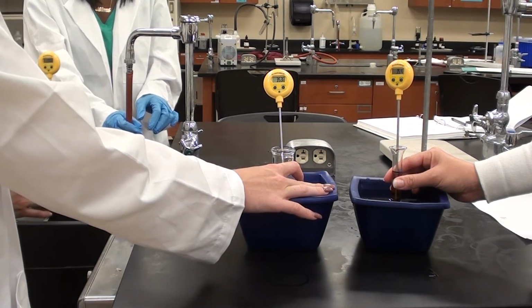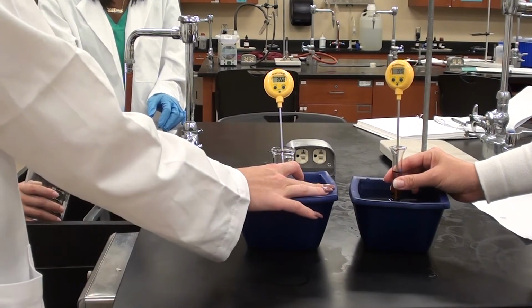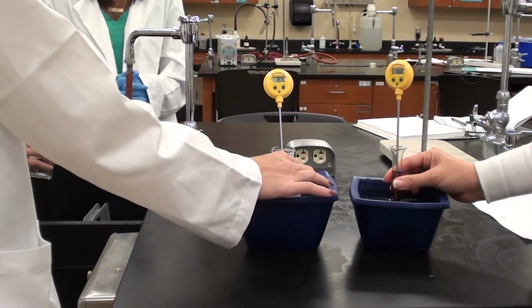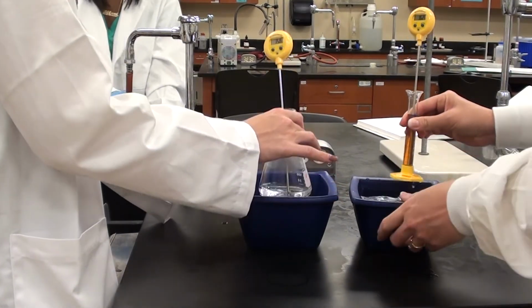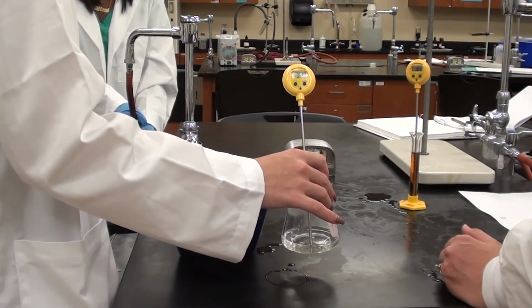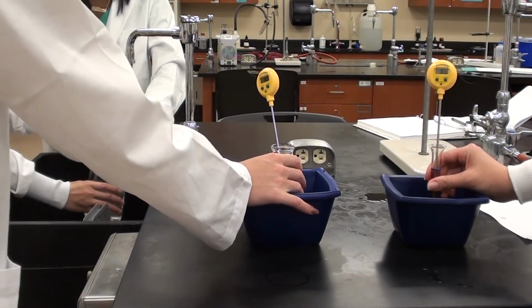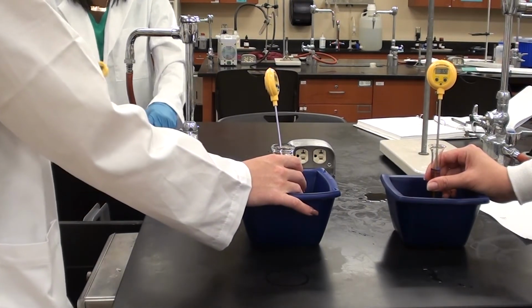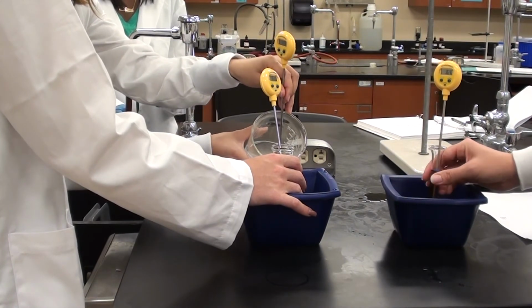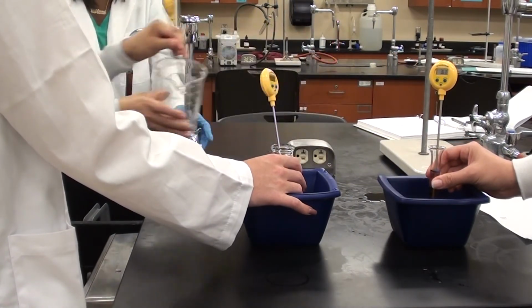So you can see we've got nice temperatures here. Presently we're at about 35.4 and 35.5, so they're nice and stable right now. Now what I'm going to ask Delaney and Sarah to do here is to empty those containers, and we'll put more 45 degree water in them so we can get them up to their optimal temperatures. Okay, yep, go ahead and add those in. We want these at the same temperature when we add them together.